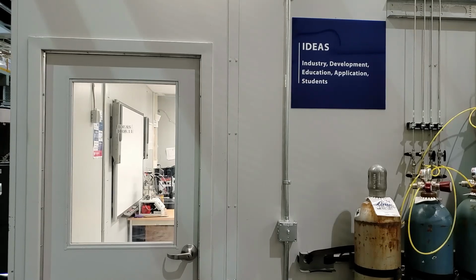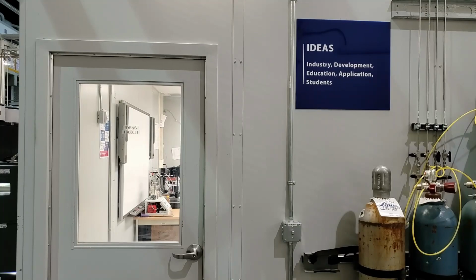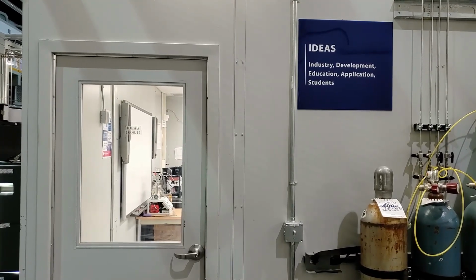Hi, I'm David Muir, the staff scientist responsible for the Ideas Beamline here at the Canadian Light Source. This video will be a tour of the Beamline's optics hutches and experimental end station.